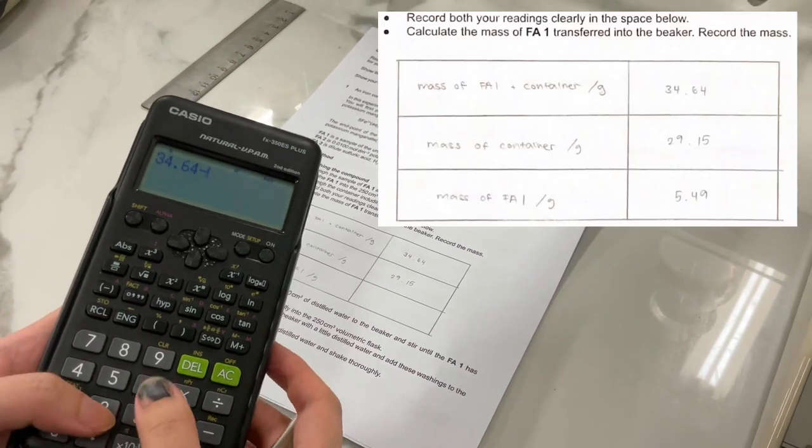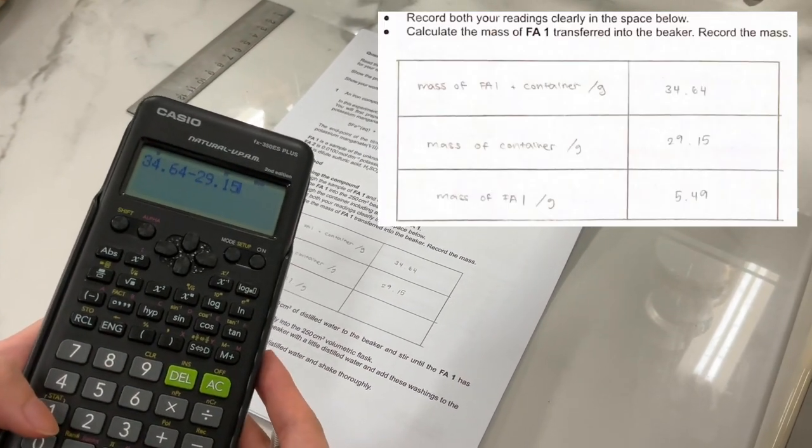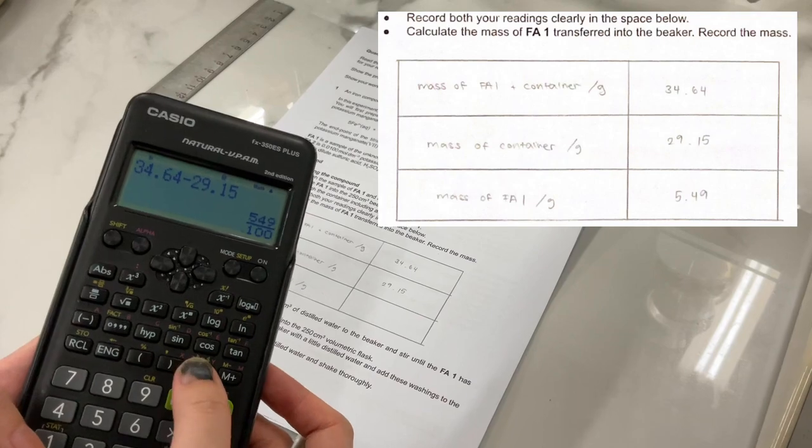You may draw a table like I did here and use it to calculate the mass of FA1 by subtracting the two masses that were recorded before.